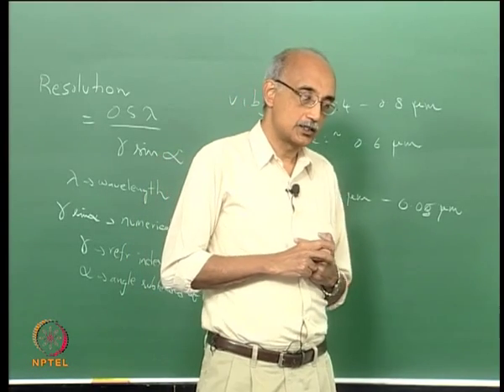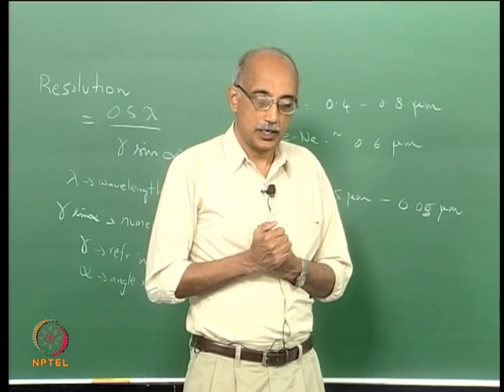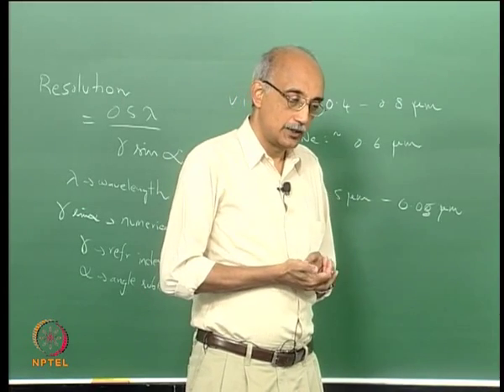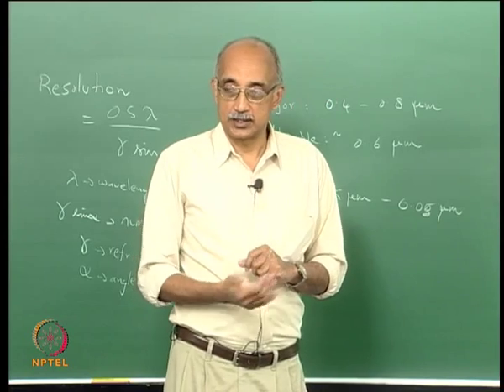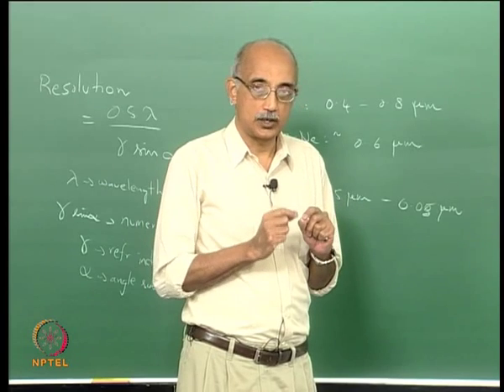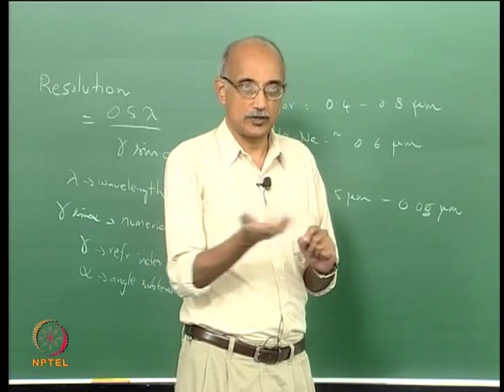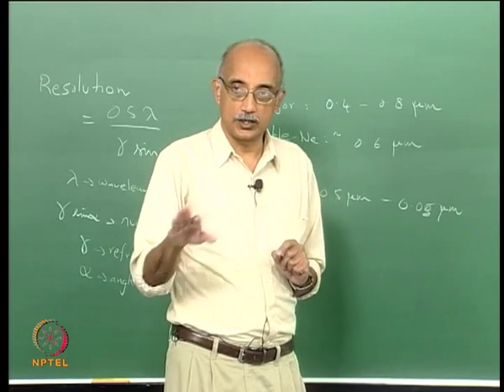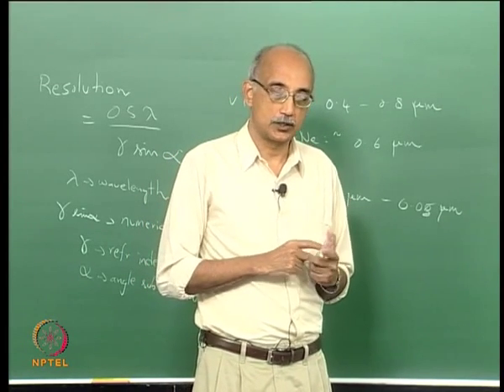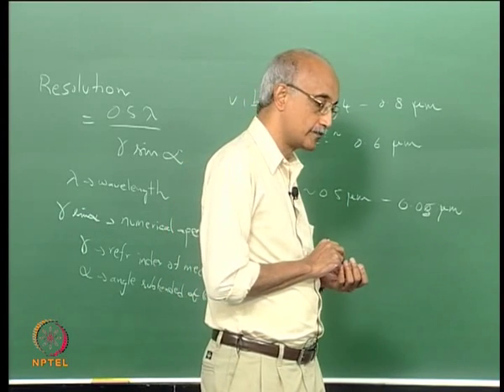Now, when you are talking about analysis of surfaces that are intentionally designed to collect particles for analysis, they certainly are designed to have features that make this analysis easy. For example, they will be highly polished surfaces so that the surface interference is minimized. However, when you are looking for analysis of particles that have collected on surfaces inadvertently, then you don't have as much control over the finish or morphology of the surface itself, and many of these analytical techniques that we have been talking about become a lot more complicated in that scenario.